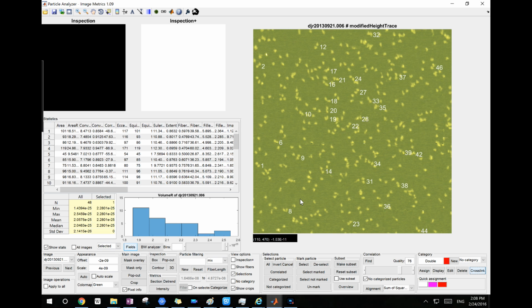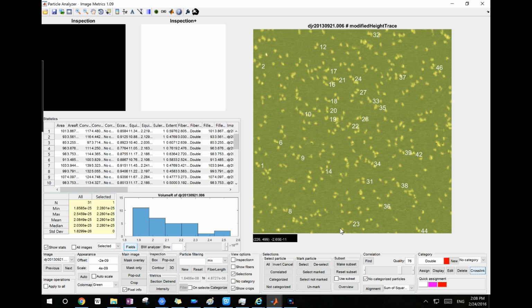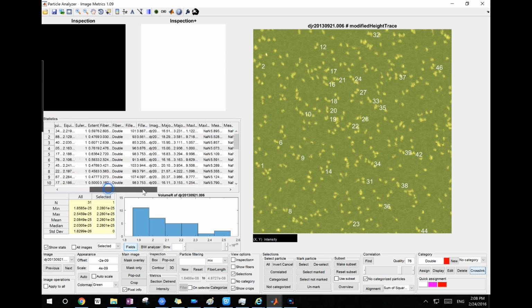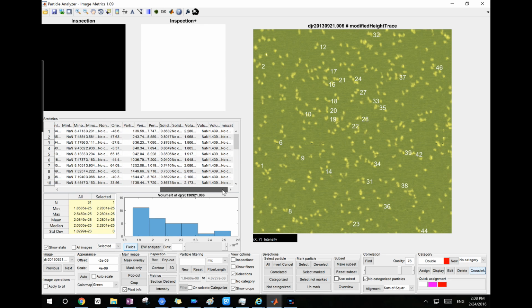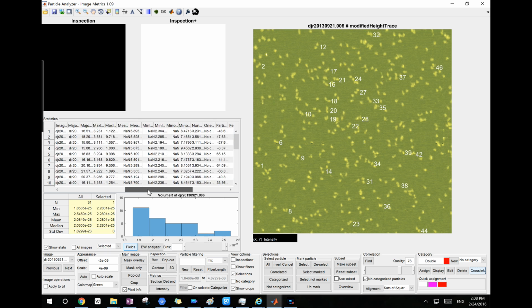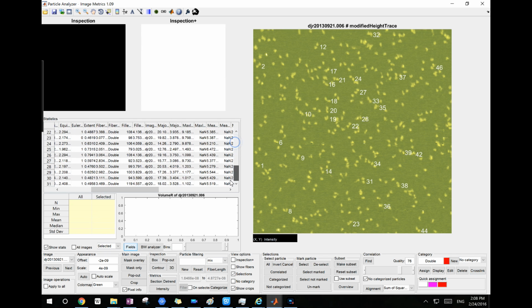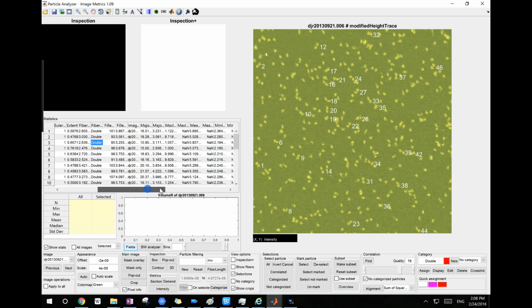So now I'm selecting the particles. I'm still in the current filter, which is mix. These selected particles should have all the features that I selected using the crosslink. So it will have the fiber length, which should be all double. Let's check them. The fiber length is here, and you see the fiber length is all double. That's already selected.